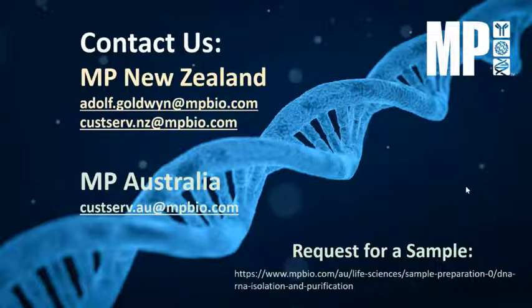And also one thing, if you're using our kit, we will recommend you to transfer the solution of the binding buffer, the whole solution mixture, to the column. Because sometimes kits will just assign a certain volume to transfer into the column. But in some situations, especially when you are facing low yield, you can try to transfer everything and spin down all the DNA to the column.